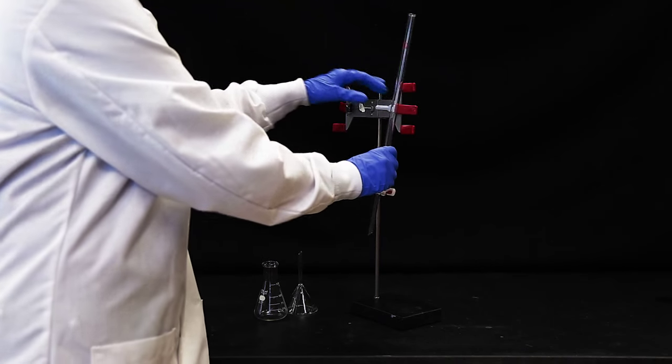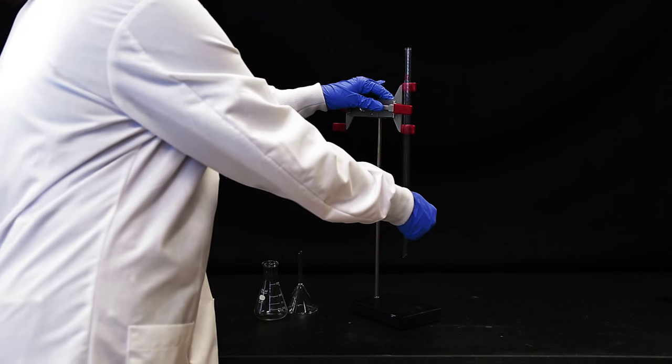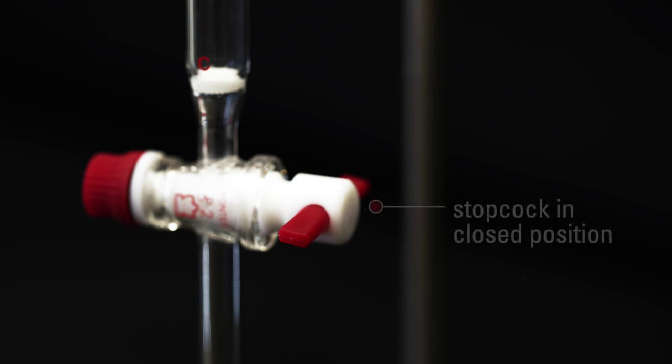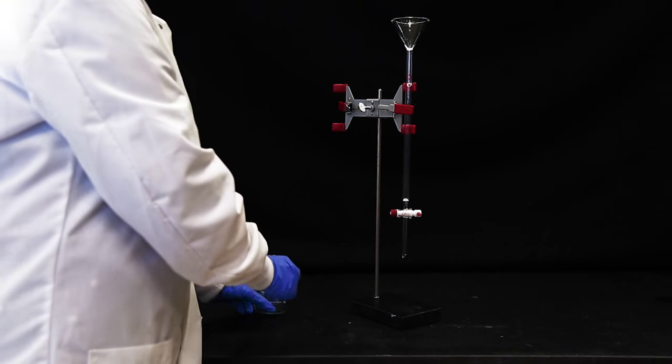To begin, use a burette clamp to secure the column to a ring stand. Make sure that the stopcock on the column is in the closed position. Insert a glass funnel into the top of the column.